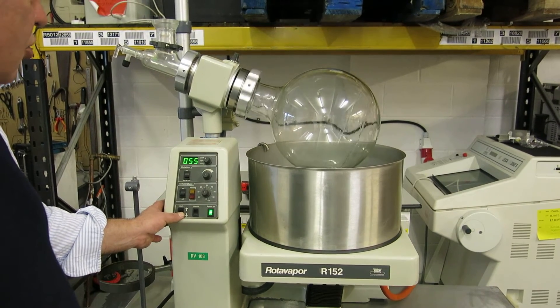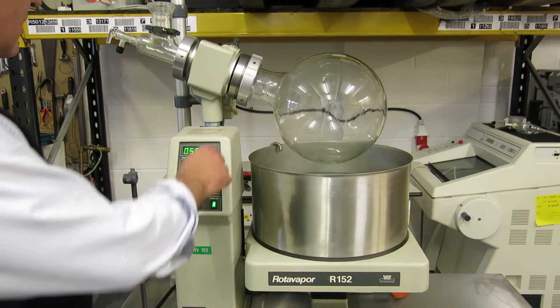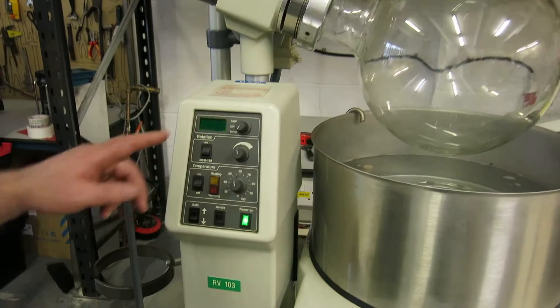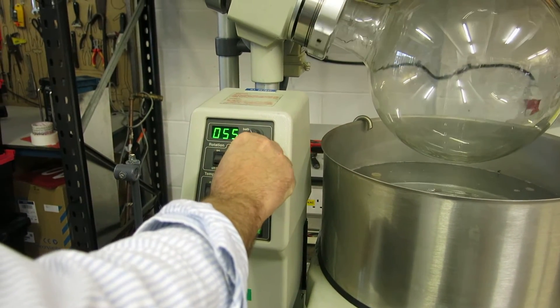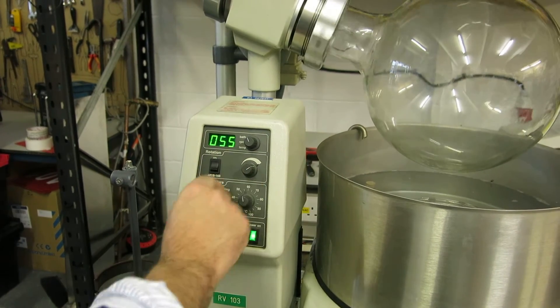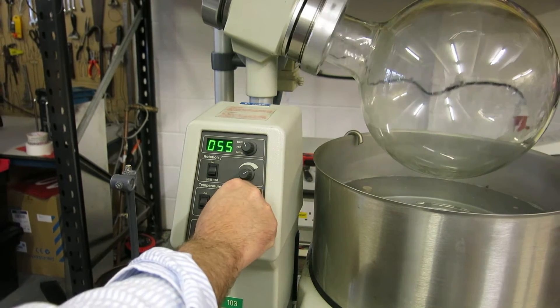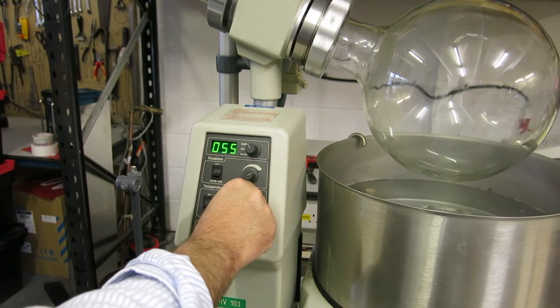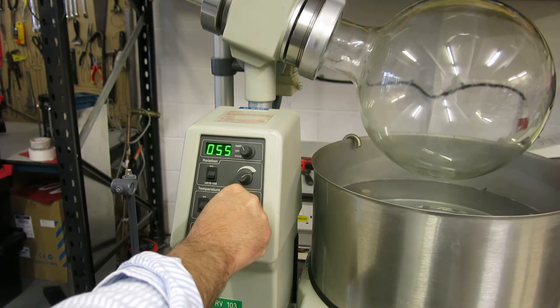You can control the temperature by way of this knob here. The bath temperature is here, so that's the speed rather than the rotation — heating temperature is here. The solenoid has kicked in: 55 degrees, which is good. You can see that's working — that tallies with that.